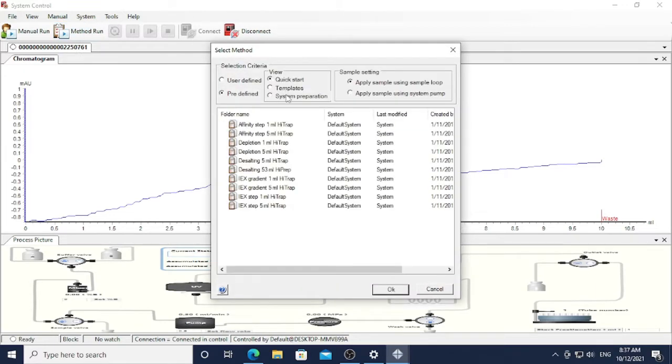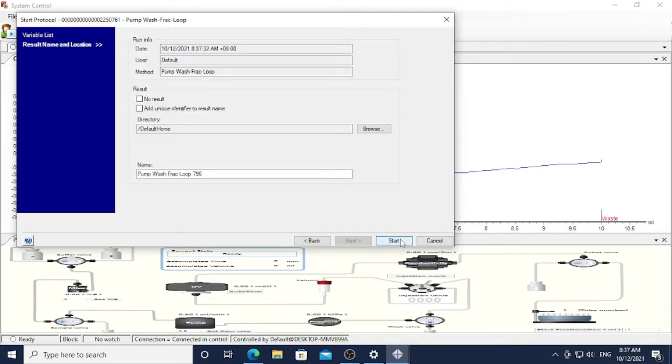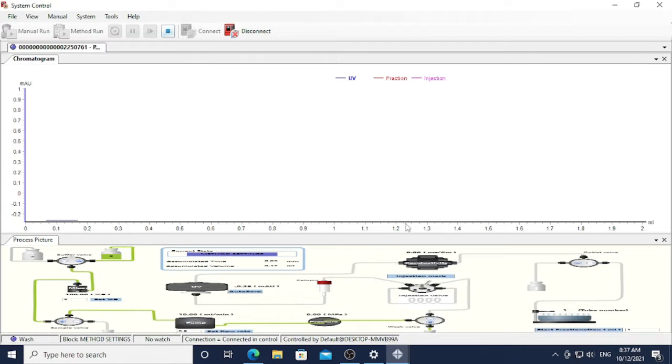Next, I am going to wash pump B. The process is exactly the same as washing pump A, but you need to make sure you select pump B, not pump A. The volume for washing pump B is exactly the same as pump A — around 10 ml. When the washing reaches 10 ml, the washing of the pump will be terminated.